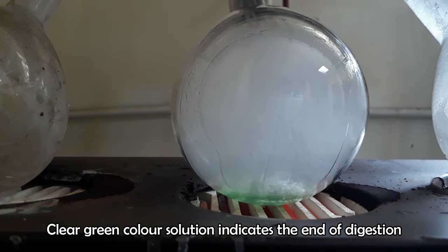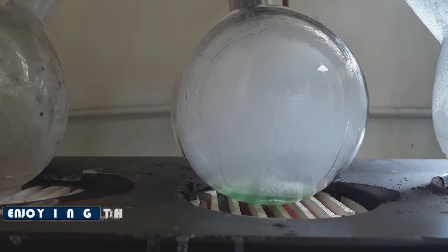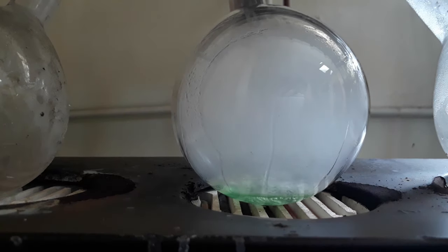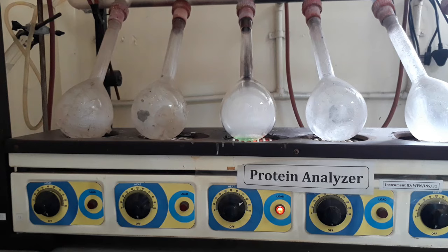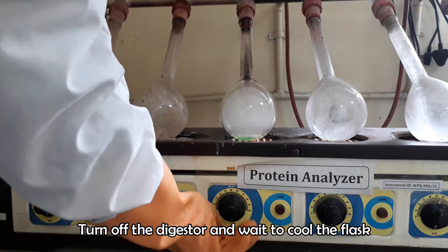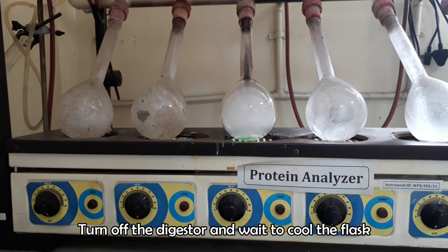After finishing the digestion, we will get a clear and green color digested juice of the sample, which will be used in the distillation step of this method. Cool the flask at room temperature.